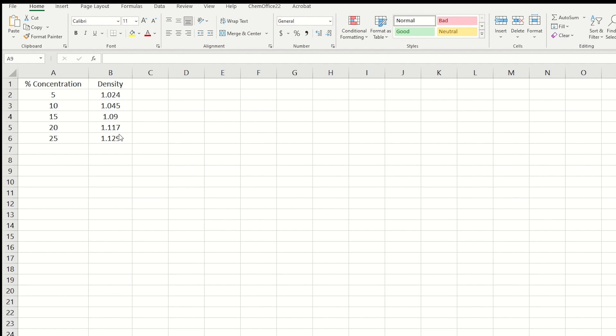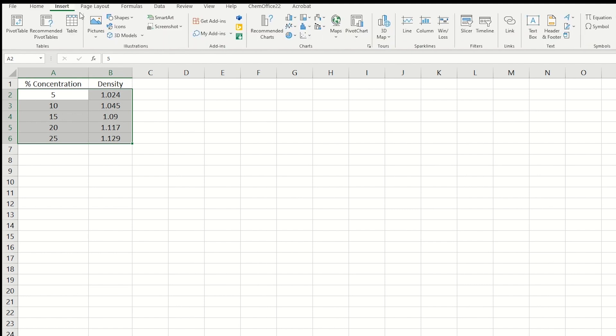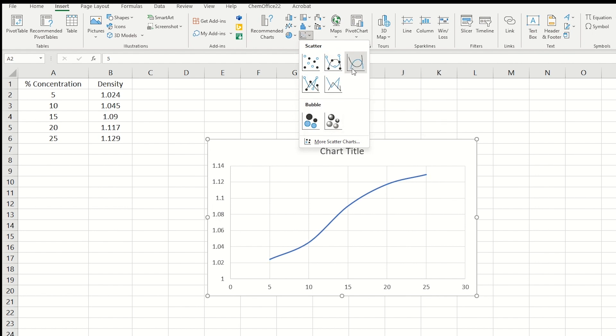I'll refer you to another video where I show you how to create an XY scatter plot. Briefly, the x-axis should be on the left side and the y-axis should be on the right side. I'll highlight both columns and then go to the Insert tab. In the middle, you'll find the charts. I'll click the icon with the dots here for the XY scatter. There are a few options, and hovering over the options will give you a preview. I'll choose the plot with the dots.